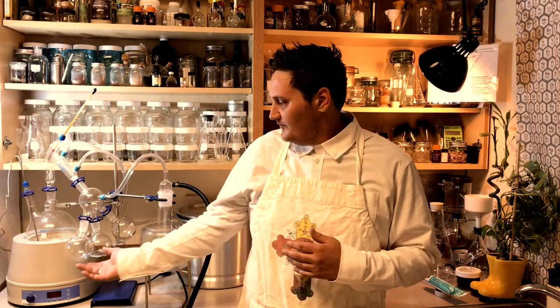In the third video, we'll remove our distillate and we'll transfer it from our receiving flask here on our distillation apparatus. We'll transfer it into some labeled canning jars, and we'll clean up all the glassware, and we'll get it ready for our next distillation. So the third video will be about removing the distillate and doing the cleanup.